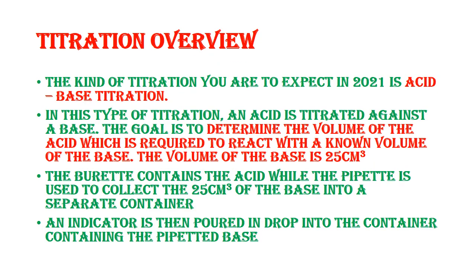This is the titration overview. The kind of titration you are expected, like I told you, in the 2021 WAEC is the acid-base titration. That is what is coming out, where an acid is reacted with a base. In this type of titration, an acid is titrated against a base.